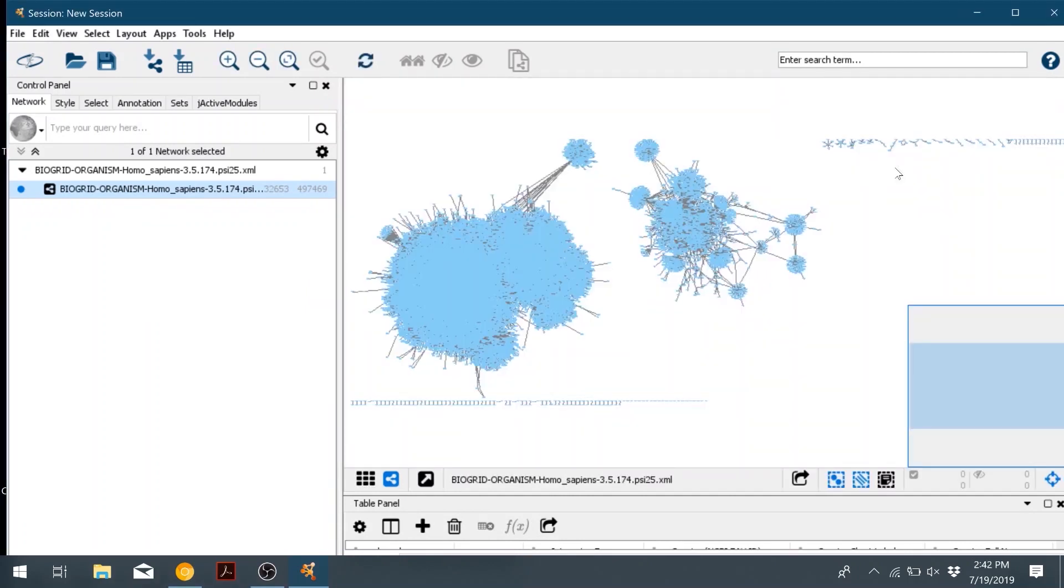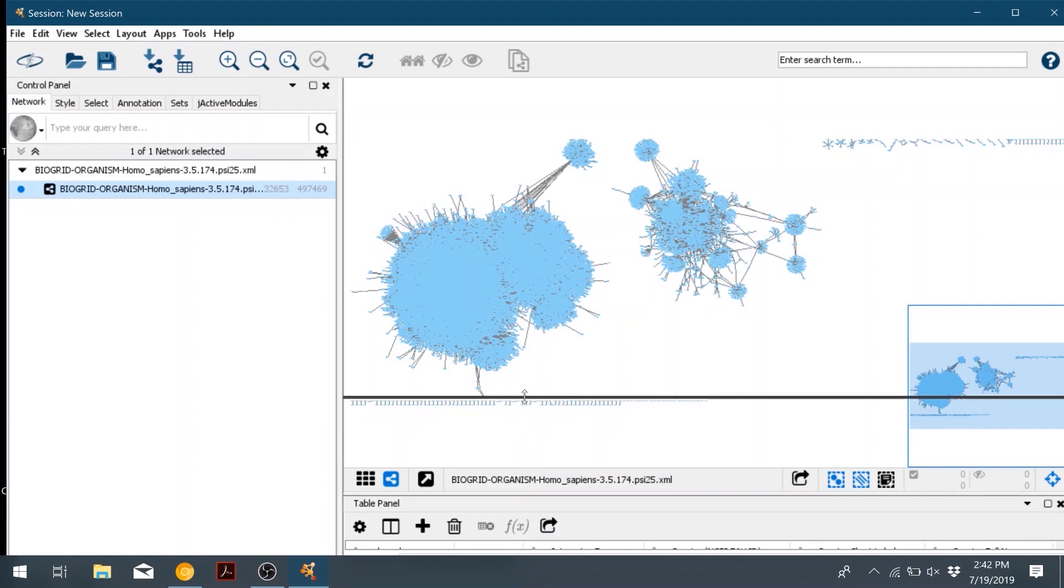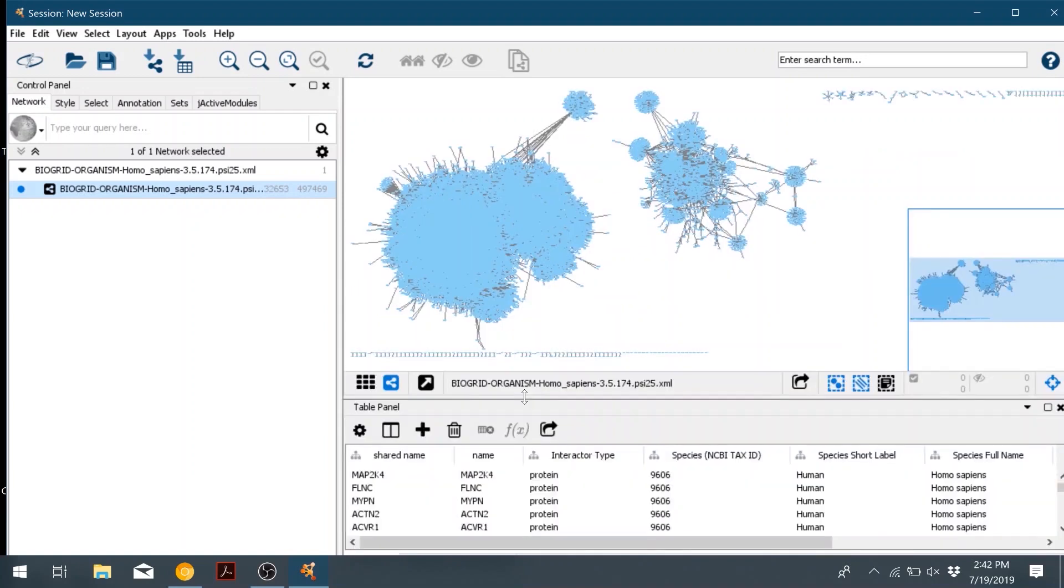Now we have our network view, and we can see that we have the actual network diagram above, and then below we have a table that contains all the nodes and the information that we got from BioGrid.